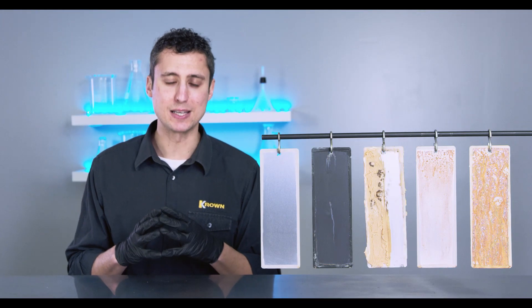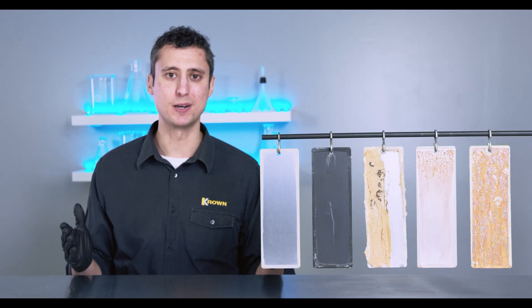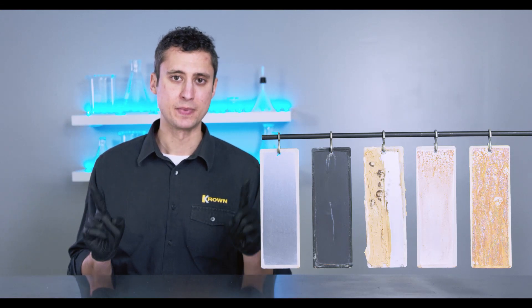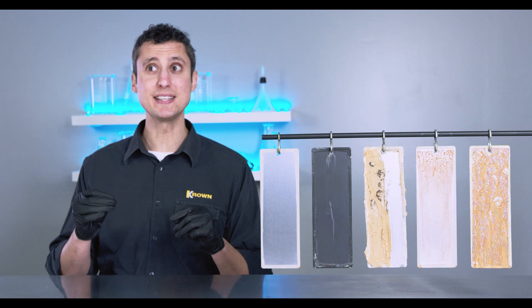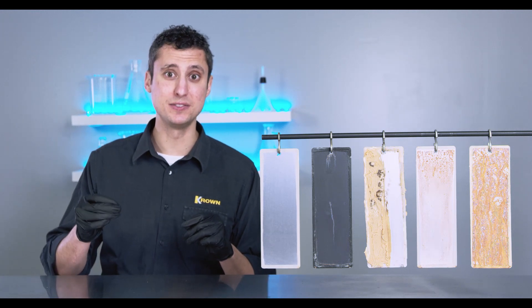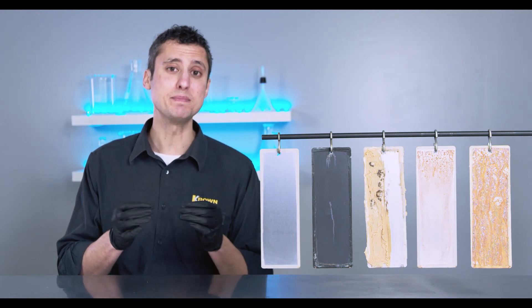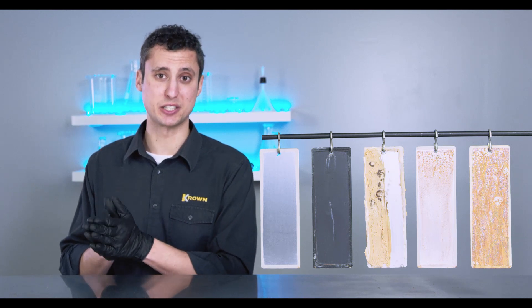Now you might be thinking at this point, why did we apply peanut butter to one of these panels? And it's to make this point very clear: just because something is an effective coating doesn't mean that it's an effective rust protection product.